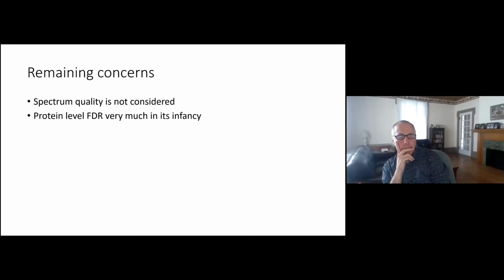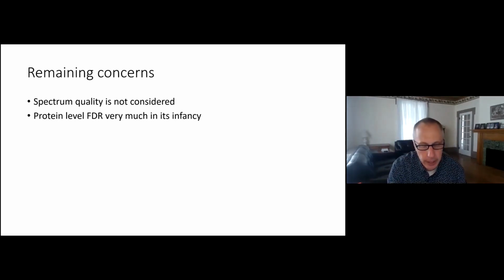So, as far as isoform level things, I would apply it exactly the same way. In fact, it's not unusual for me to use protein isoforms in the protein database. That's common for me. And I treat it the same way. And I treat it to protein groups. Some people don't use protein groups at all in this calculation. So the answer is a qualified no to your question.